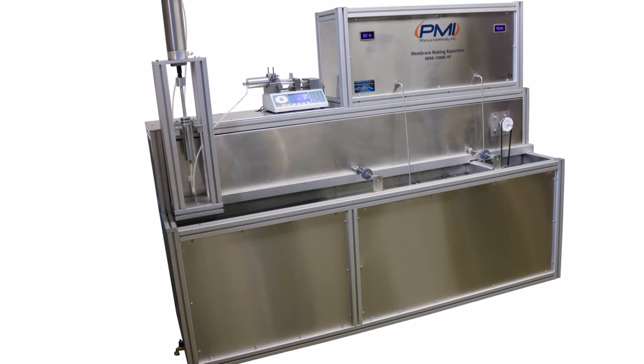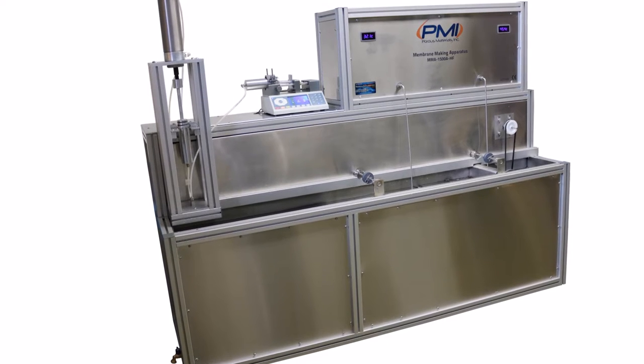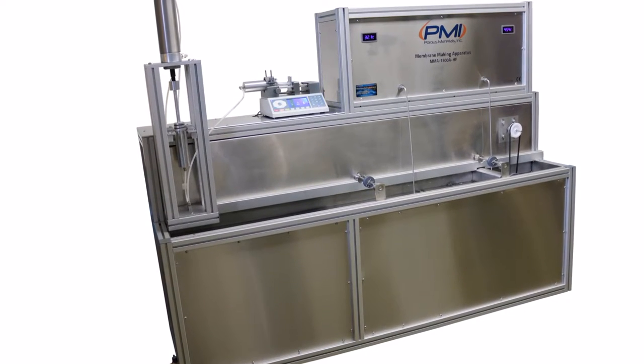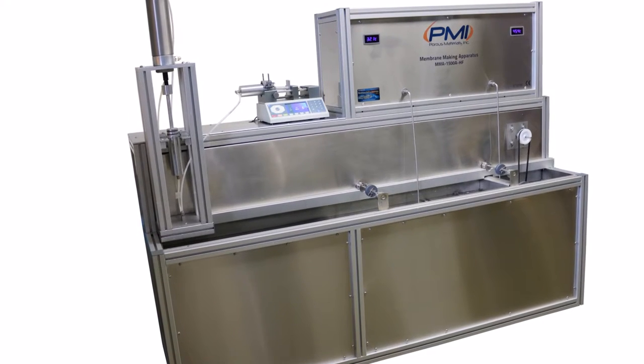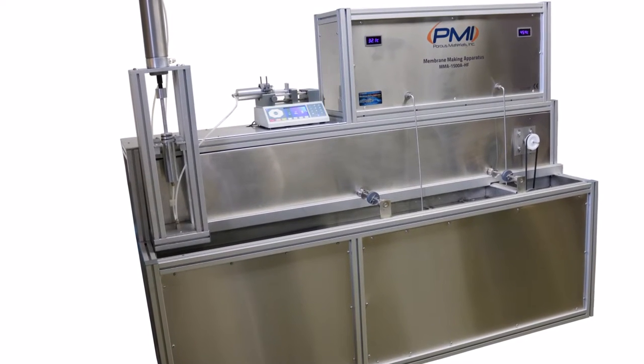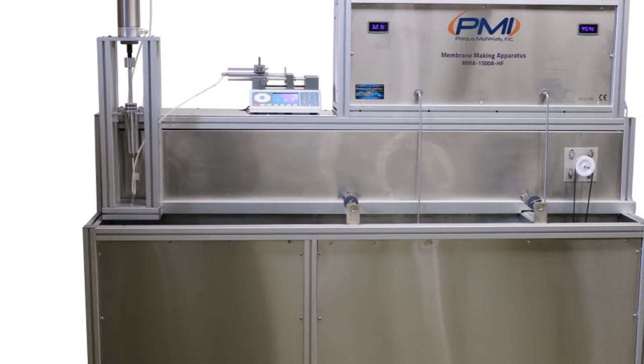Porce Materials Incorporated is proud to present the hollow fiber membrane making apparatus. This machine is capable of making hollow fiber polymeric membranes with outer diameters between 0.8 and 2 millimeters from any conventional polymer.